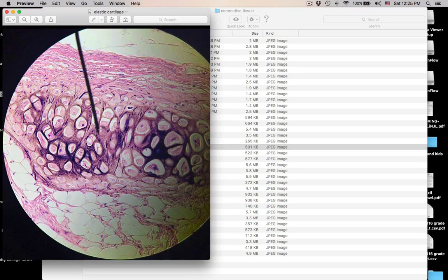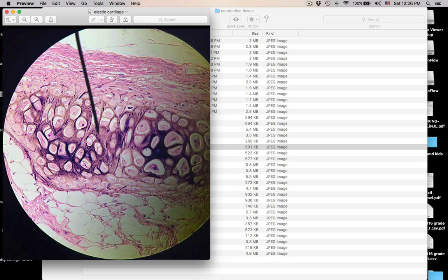What is this? Those white things are lacunae with chondrocytes. The matrix has elastic fibers, and here's the perichondrium, where the avascular cartilage gets its nutrients. This is elastic cartilage. Where do you find it? Remember the three E's: elastic cartilage, epiglottis, external ear. And here's some more adipose tissue down here.